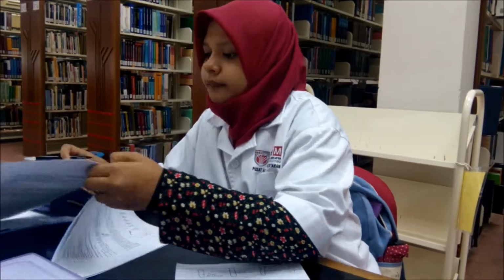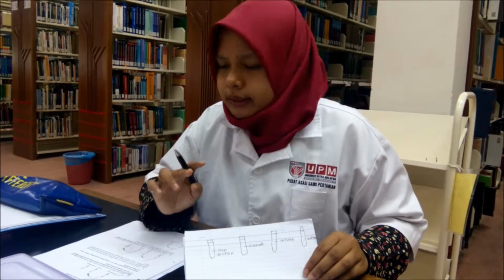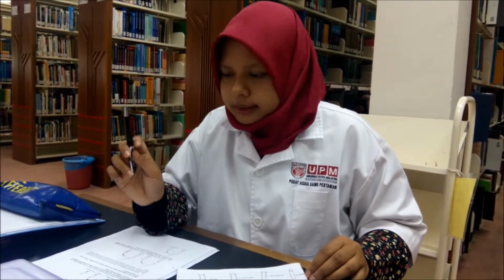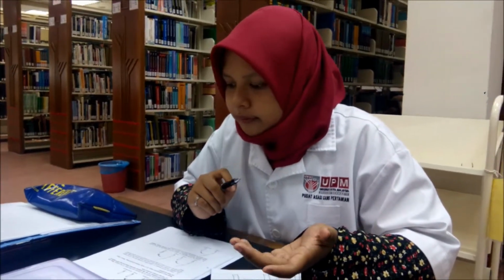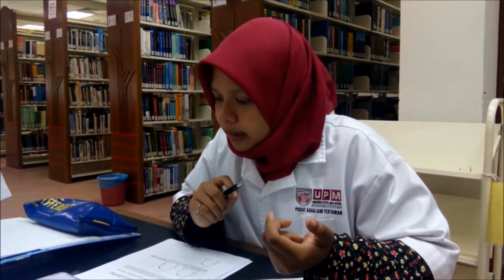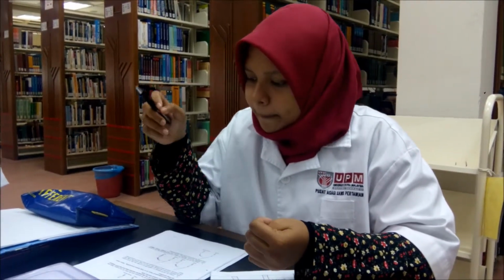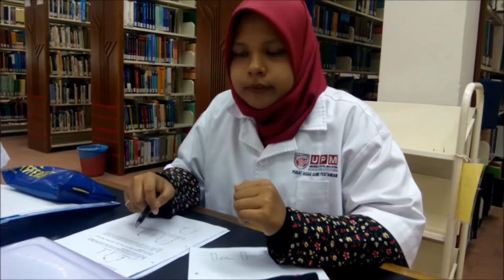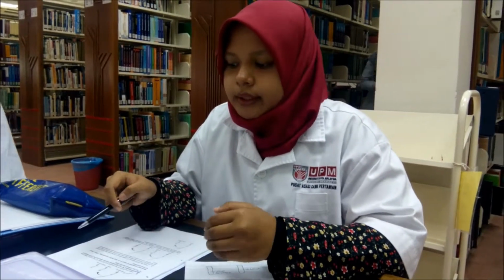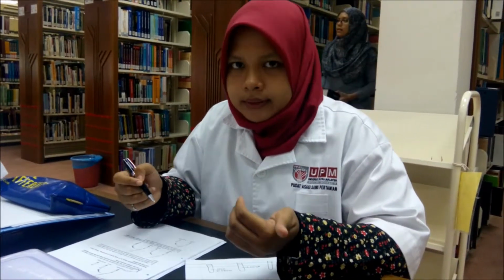And then the two empty 15 milliliter conical tubes are labeled one enzyme reaction and one control. Using a clean micropipette, 2 milliliters of 1.5 millimolar substrate is pipetted into the 15 milliliter conical tube labeled enzyme reaction. Then use the same micropipette and pipette 1 milliliter of 1.5 millimolar substrate into the conical tube labeled control. Then rinse the micropipette well with water.